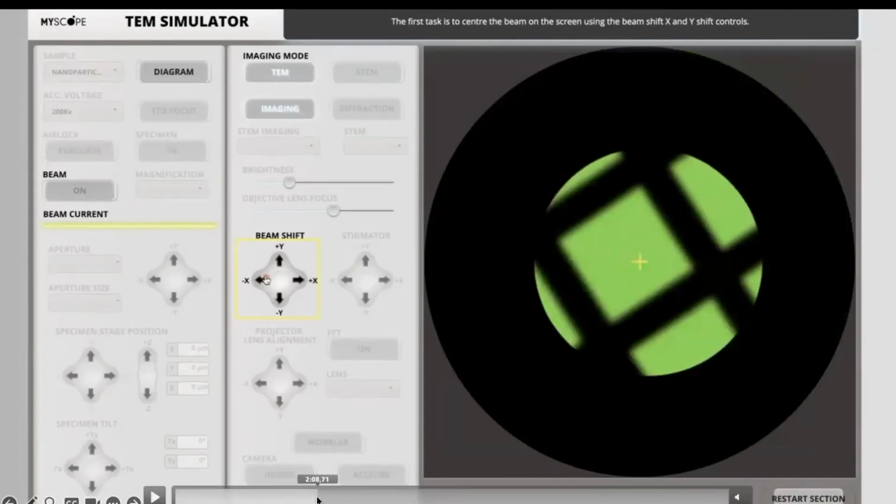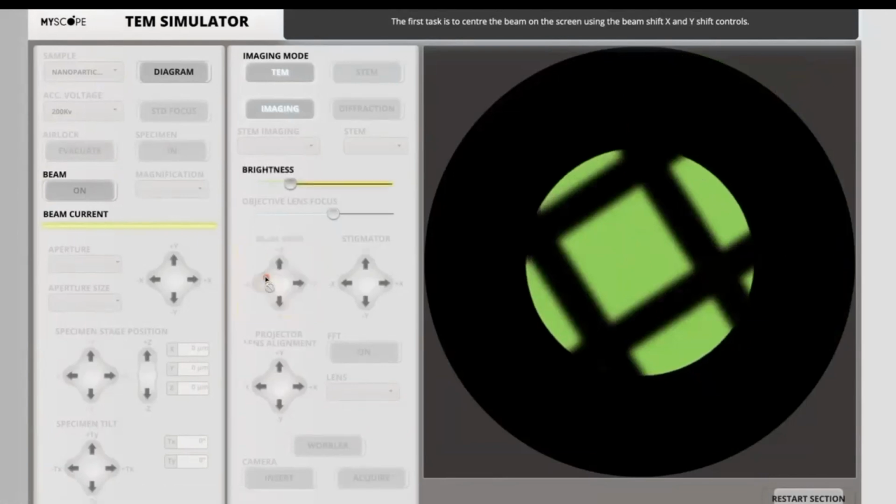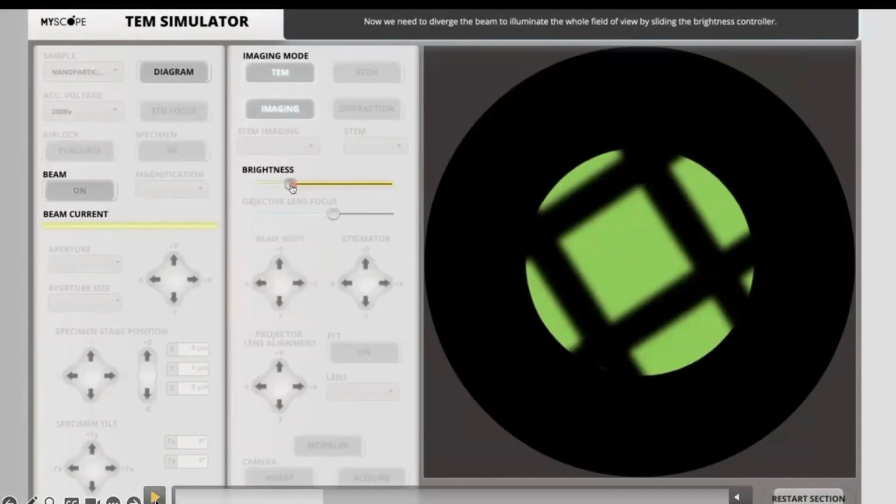What you see, these grids are the metallic grids, which can be copper or gold. It also has a support film, which can be carbon, formvar, or even graphene or silicon nitride, very thin, 5 to 30 nanometer thickness. There are hundreds of these grid areas present.